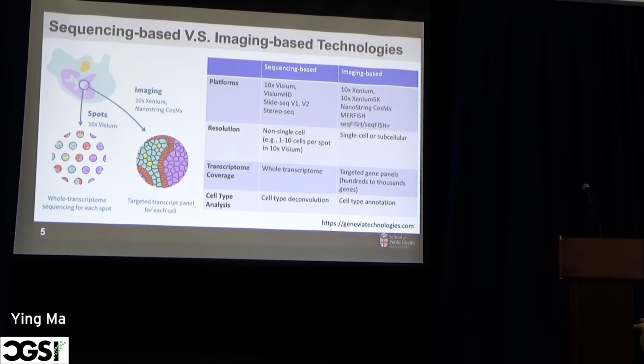So let's look at these. If we have a tissue sample and generate data from the 10x Visium technology, each spatial location is called a spot. Because multiple cells can be located in the same spot due to the low resolution, each spot captures the mixture expression across a bunch of cells. Depending on the platform, the number of cells can vary. For the 10x Visium technology, it goes from 1 to 10 cells, and for higher resolution technologies such as Slide-seq version 2, it is probably at most 3 to 5 cells.